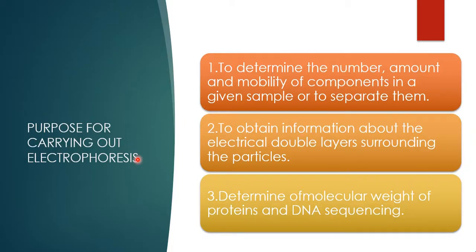Then coming to the purpose of carrying out electrophoresis. You may have a doubt why we have to use electrophoresis. I told you in the initial step that it is majorly used in molecular separations, your DNA, RNA, all the things. So electrophoresis is mainly used to determine the number, amount, and mobility of components in a sample, or to separate them. That's the main purpose.